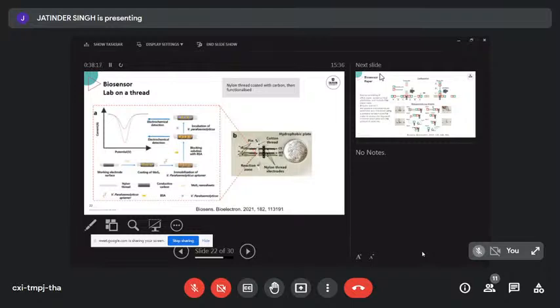The parts where proteins could stick are pre-blocked with BSA, and then with that functionalized carbon electrode, it is actually possible to do electrochemical detection when we've got three bits of thread from a bit of fabric sitting together. We know from the washing machine that our clothes get wet, so they absorb water by wicking. The threads by themselves do that as well.